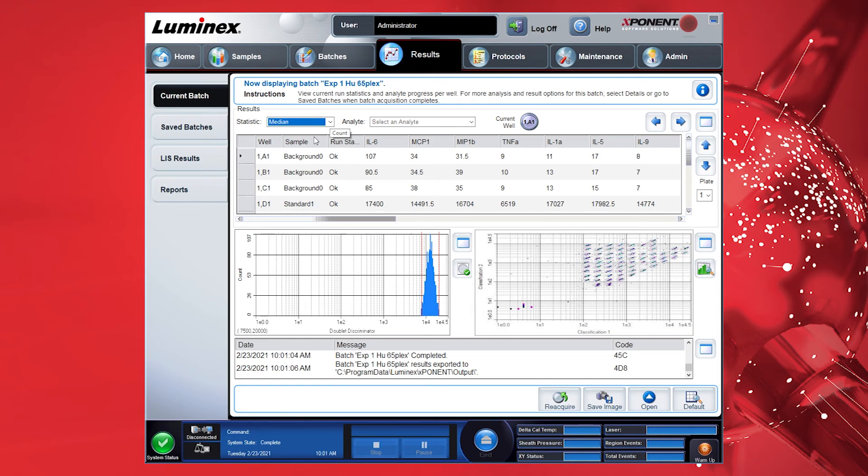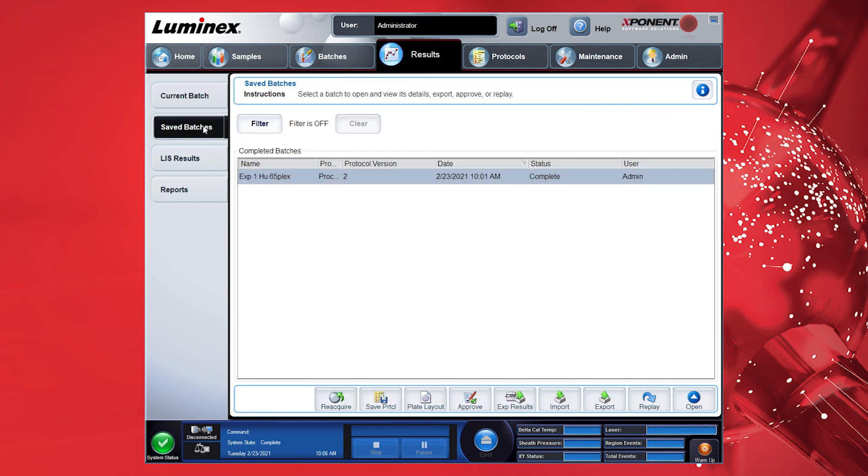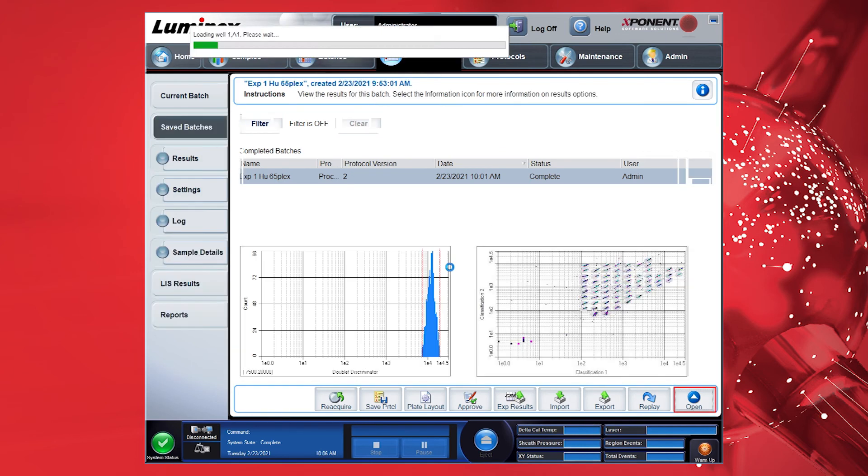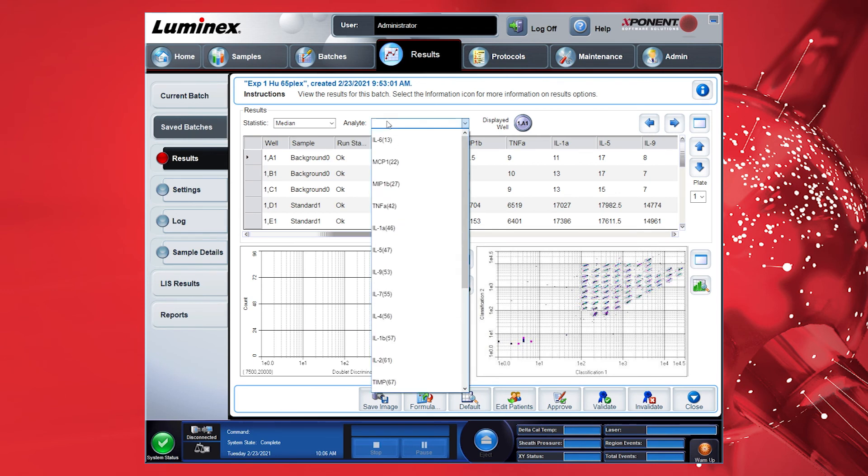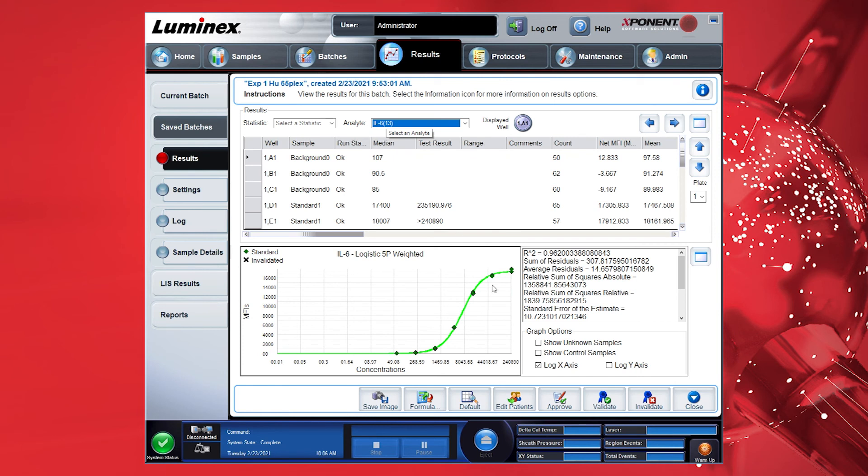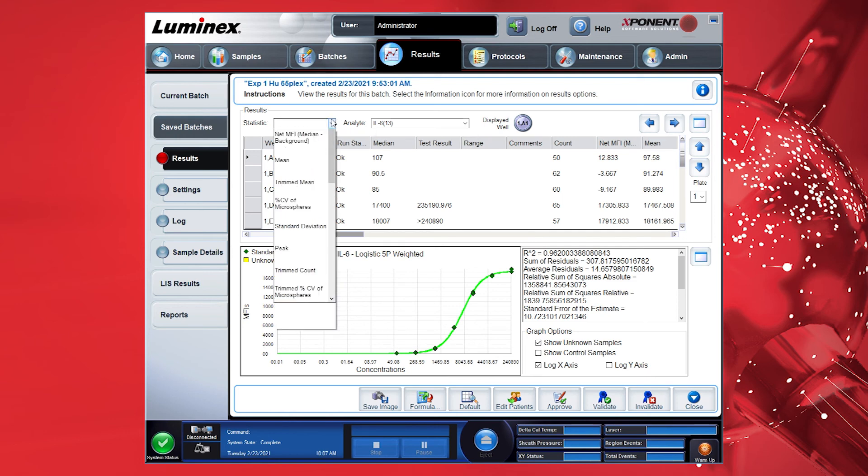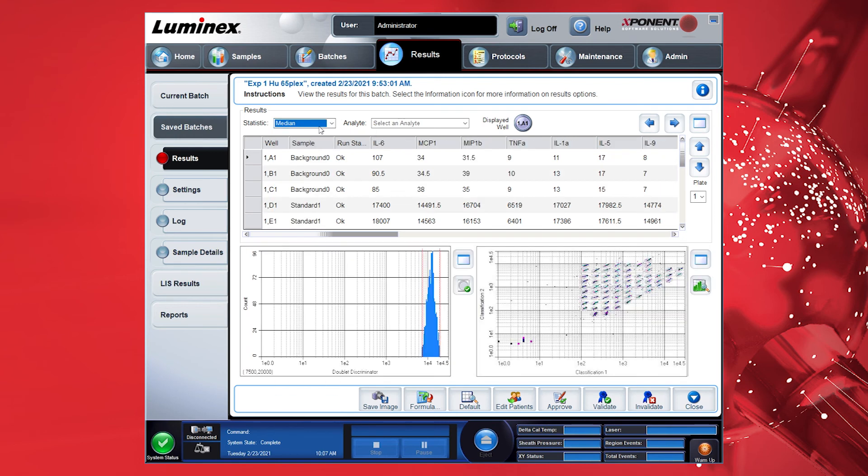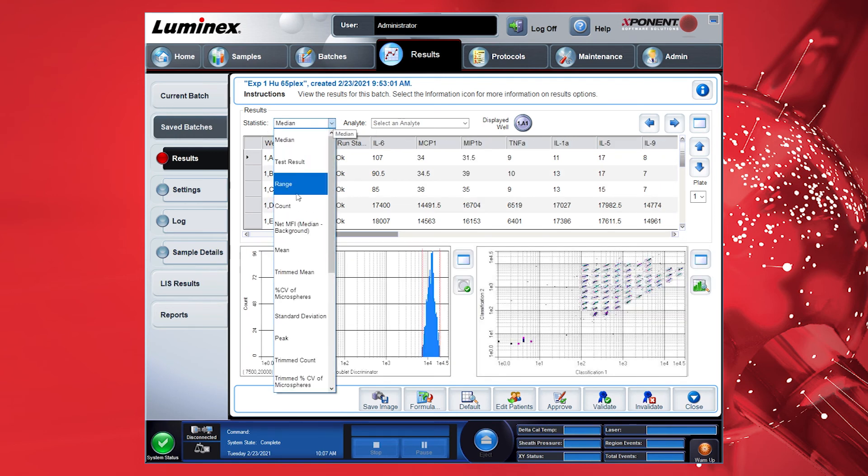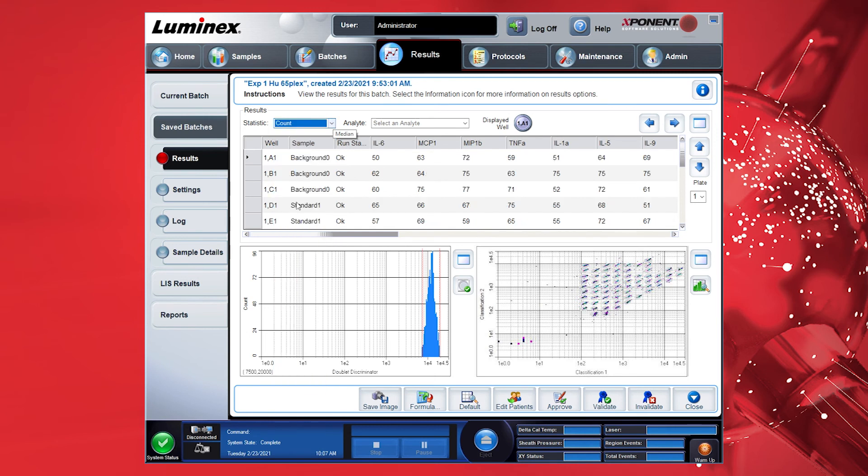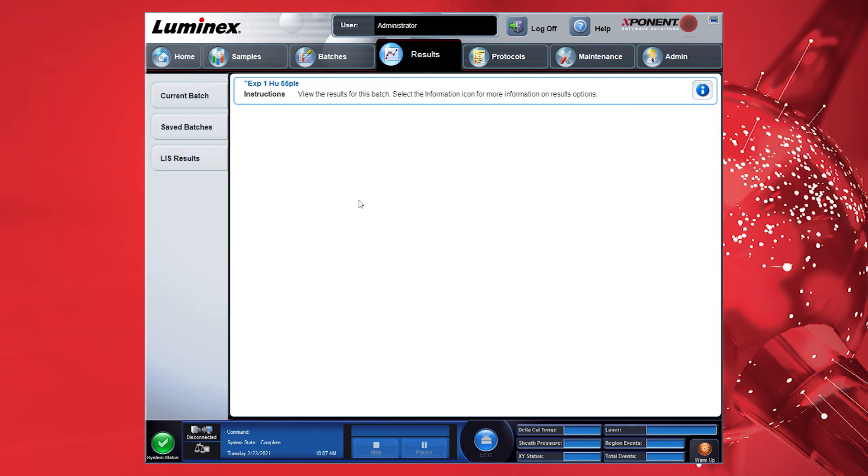At the completion of the assay run in the Results tab, select Save Batches in the left side navigation menu and pick the relevant batch. Here you have the option to open the batch via the Open button and review the raw data including the standard curve. You can select the Show Unknown Samples box to view unknown data points. You can also use the Statistic drop-down to view batch statistics for all measured targets. After reviewing and editing the results, save and close the batch file.